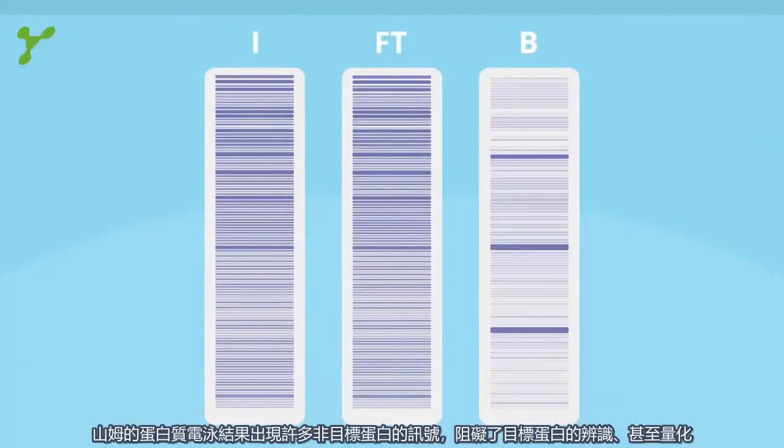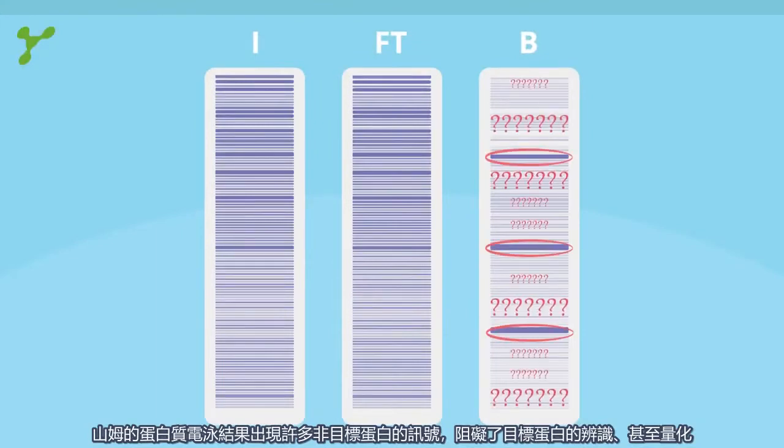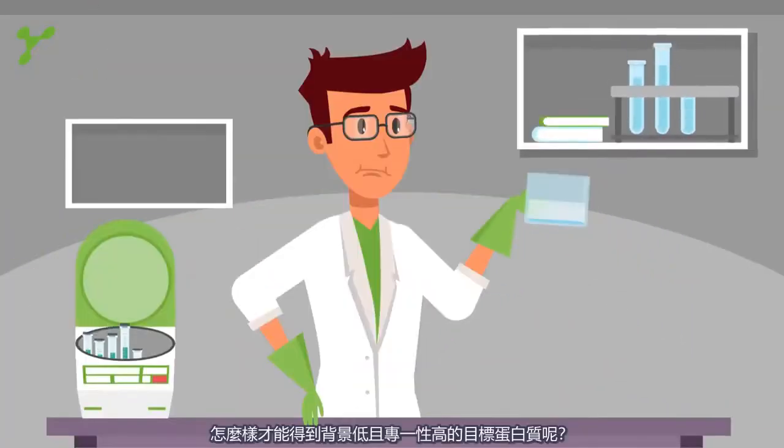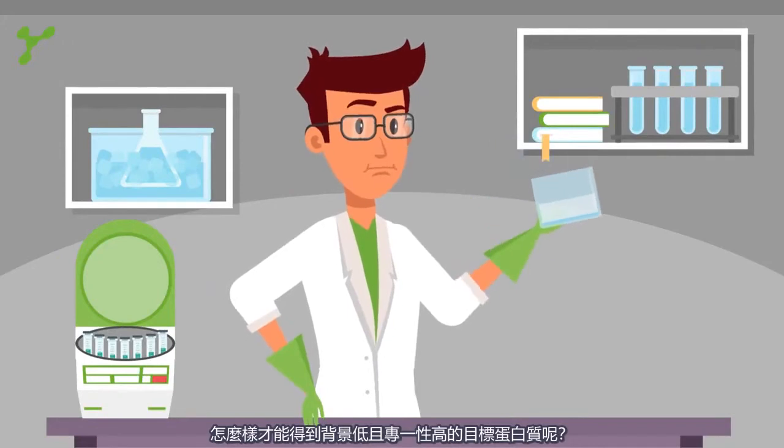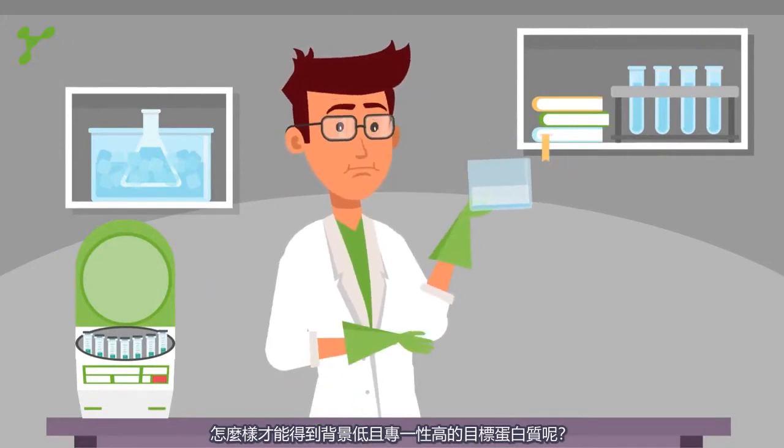There are multiple bands and a lot of background. How can he avoid the messy background and keep the protein of interest?